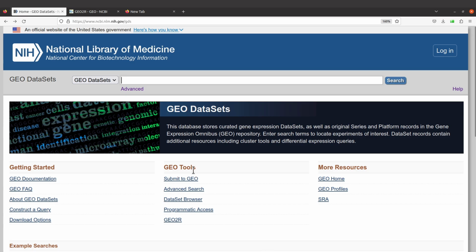So when we are here, you have to search by supplying some terms or keywords, and then you have hits and you can select the appropriate study. So let's just say we are interested in studies that have been done for zebrafish. In this tutorial, because we are going to analyze RNA Seq data, we are going to take RNA Seq studies that were done using zebrafish samples. And so I will type zebrafish here, and then I am going to search.